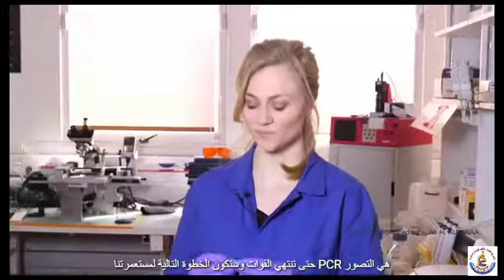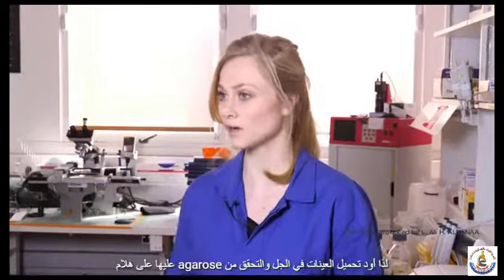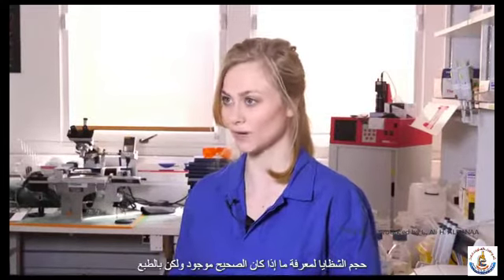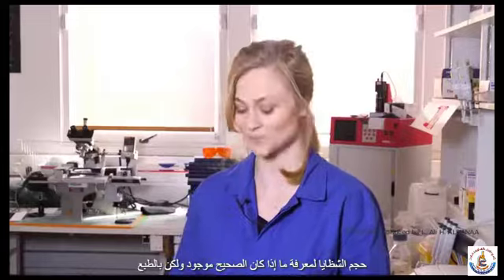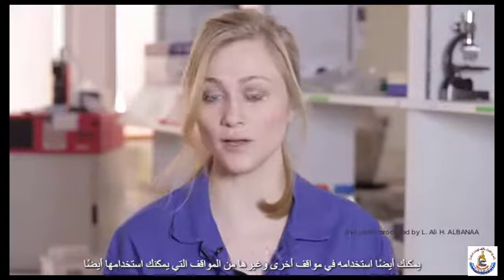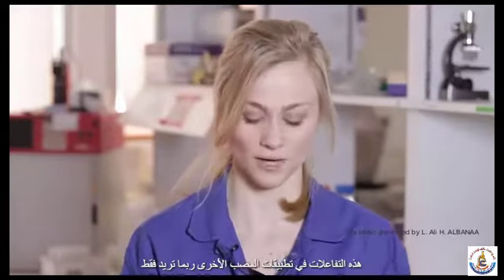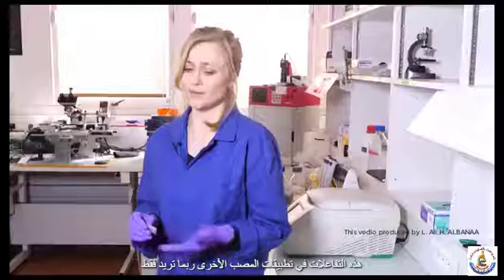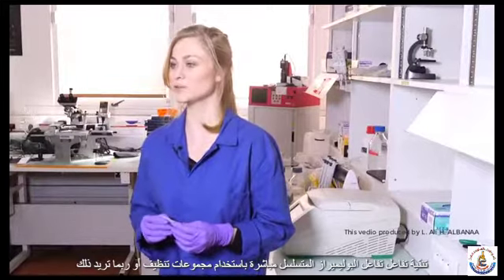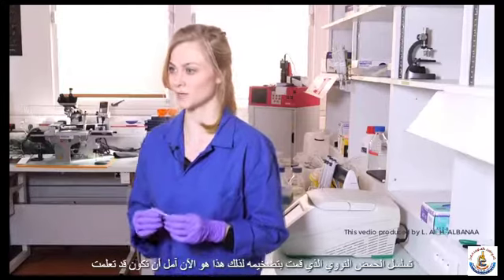So the tubes are done, and the next step for our colony PCR would be to visualize them on an agarose gel. So I would load the samples into the gel and check the size of the fragments to see if the correct one is present. But of course, in other situations, you could also use these reactions in other downstream applications. Maybe you just want to purify the PCR reaction directly using a cleanup kit, or maybe you want to sequence the DNA that you amplified.